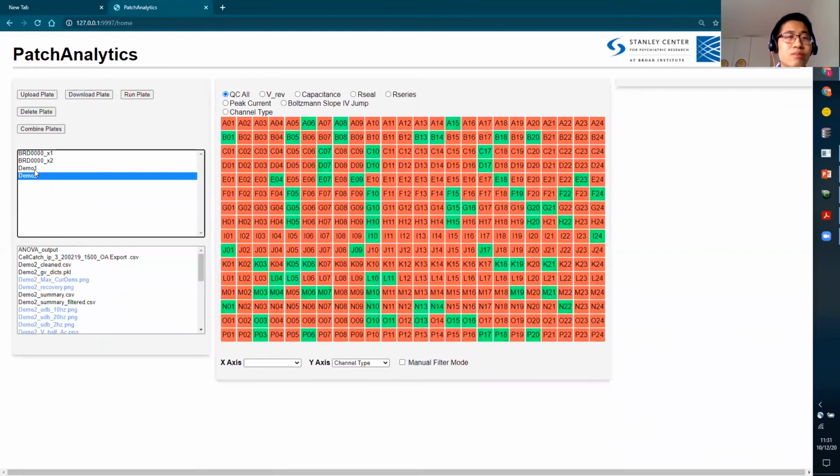And we have two demo plates here from the NAV 1.2 experiments. Another use case is that we usually want to combine multiple plates. If you do that in Excel, you have to copy, paste, and maybe rerun your template, but your template might not be designed to handle multiple plates, and that can be an issue.